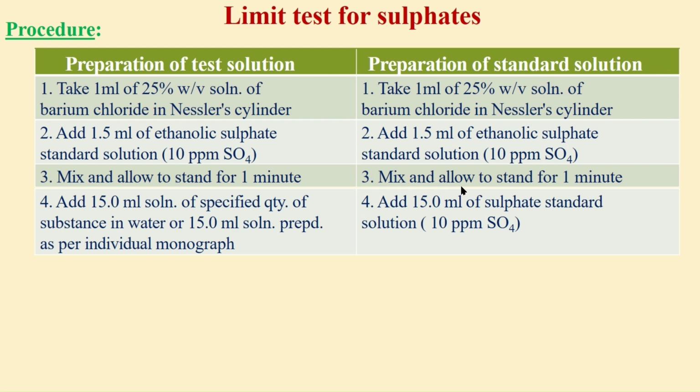Then to the test solution, we add 15 ml solution of the specified quantity of the inorganic or organic substance which is dissolved in water. And each and every substance we use may not be soluble in water. In that case, the pharmacopoeia prescribes how this 15 ml solution is prepared. As per that, we have to prepare and add 15 ml of solution of the specified quantity of substance in water.